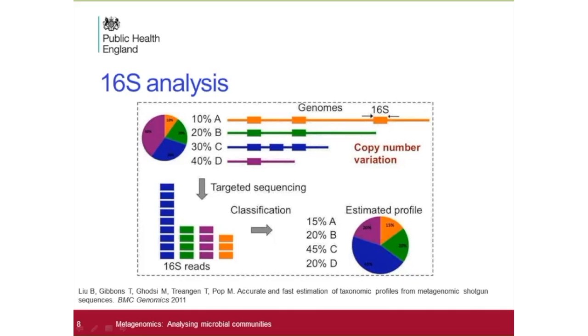And if you look then on the bottom of the slide, you will find that organism D is underrepresented by 50%. So there's a reduction of 50% of the number of reads that are associated with this organism. And this indicates that using 16S analysis as a way to estimate the abundance of flora, without taking into consideration how many copies of the 16S loci are on the genome of this organism, can be misleading.